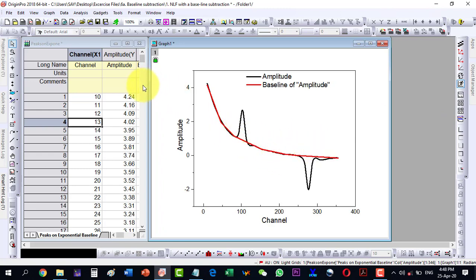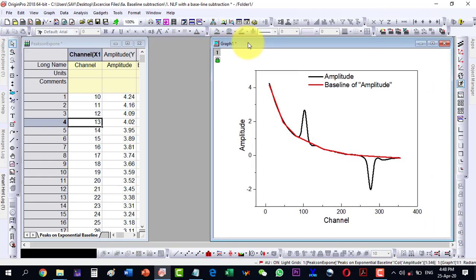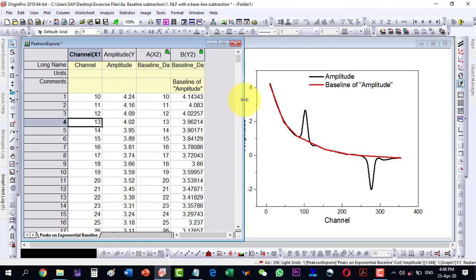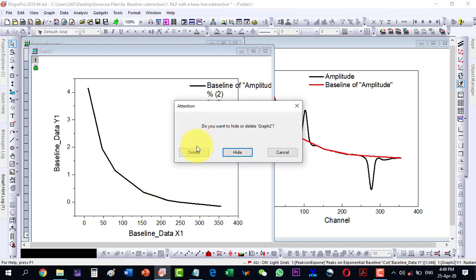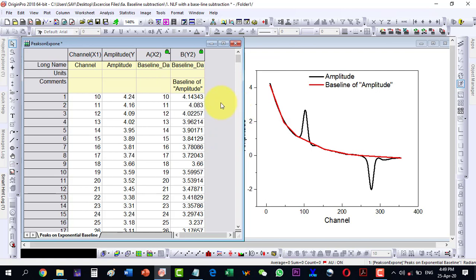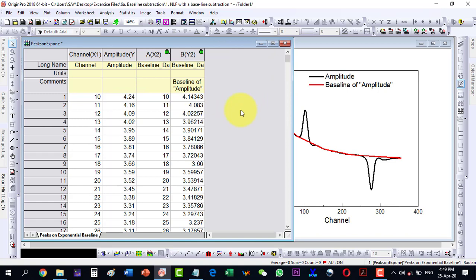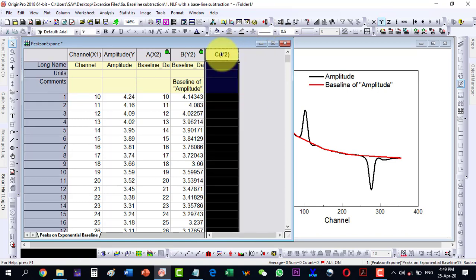Looking at the data, it has created an X column and a baseline column. Plotting the baseline column shows only the baseline curve. I want to plot the amplitude that is baseline corrected — the baseline values need to be subtracted from the amplitude column to get the corrected values.